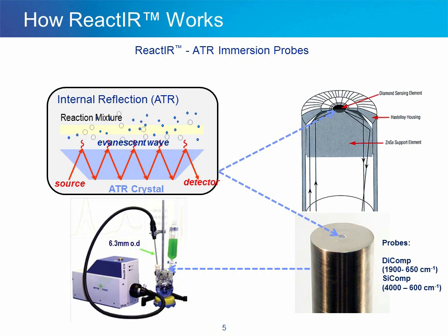It's about 1 millimeter in diameter. But don't let that fool you. The sensitivity of this detector is incredible. I've had a 10 to the minus 2 molar limit of detection for relatively insensitive compounds. I use two types of probes.